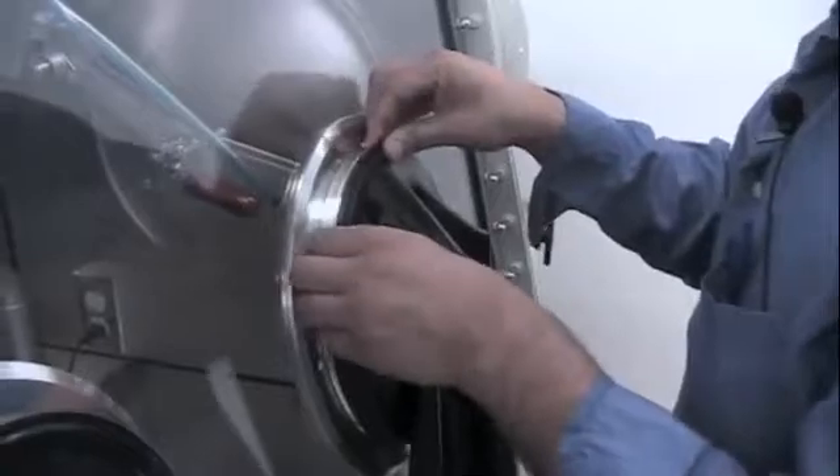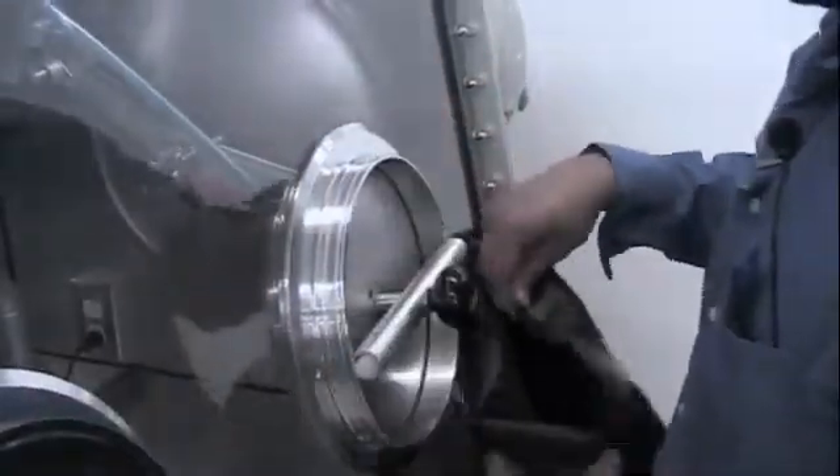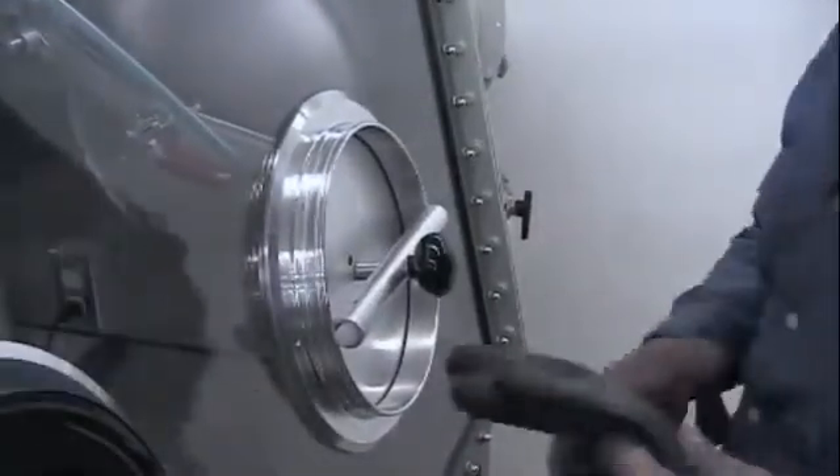The next step is to remove the old glove. We remove the old glove and we are going to install the new glove.